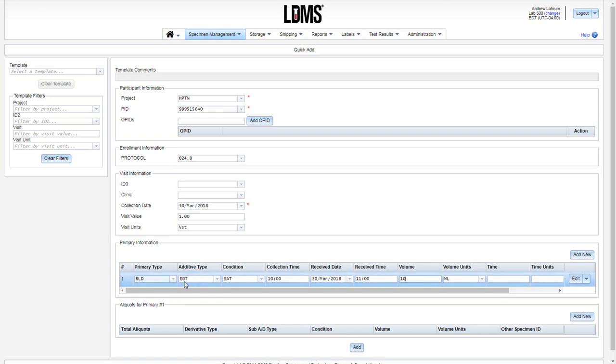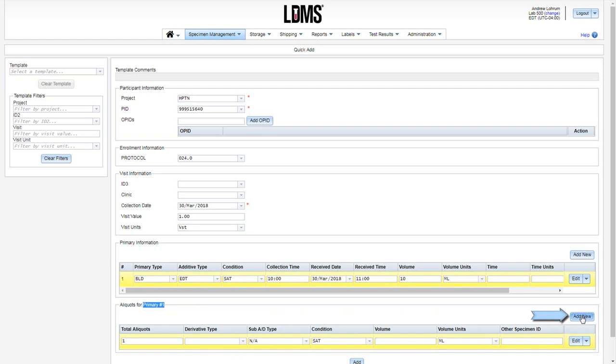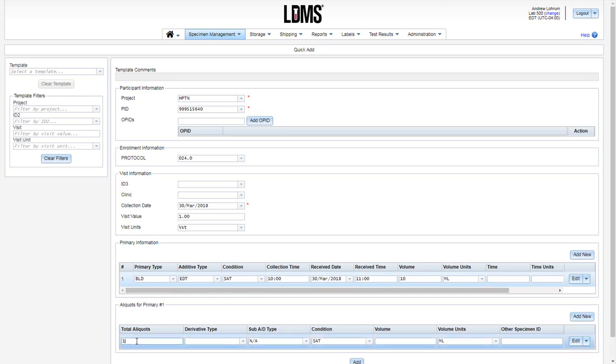With the primary highlighted in blue, we can now add aliquots to it. In our aliquot grid, we see the badge above the section shows what primary number is highlighted. Click Add New above the grid. It'll create one line. To the left, enumerate your total aliquots.